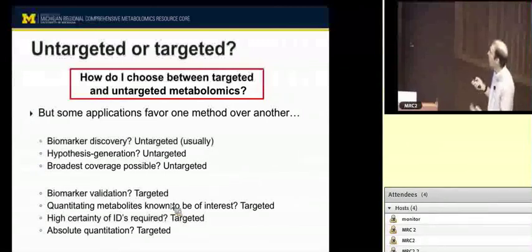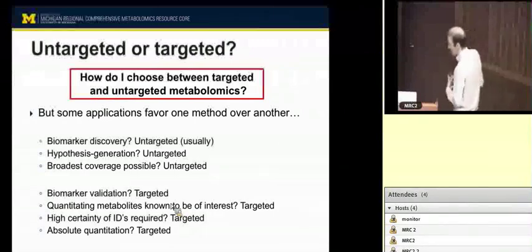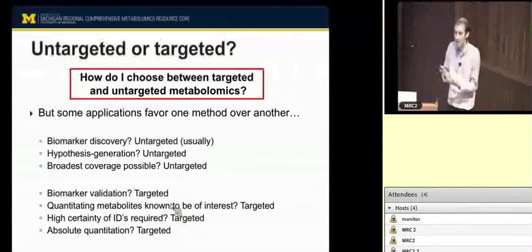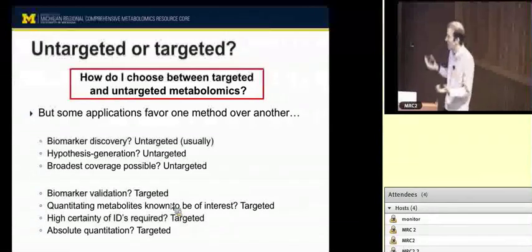But basically, the goal out of this process, which is sometimes successful and sometimes partially successful, sometimes unsuccessful, is to get a confirmed ID, or if not that, a putative ID, depends on how far you want to go and how much time you want to spend, that is a candidate or candidates for the identity of that metabolite. So this is to give you a sense, not that, oh my gosh, you're telling me that we're not going to know what comes out of a metabolomics experiment and what good is that to me.